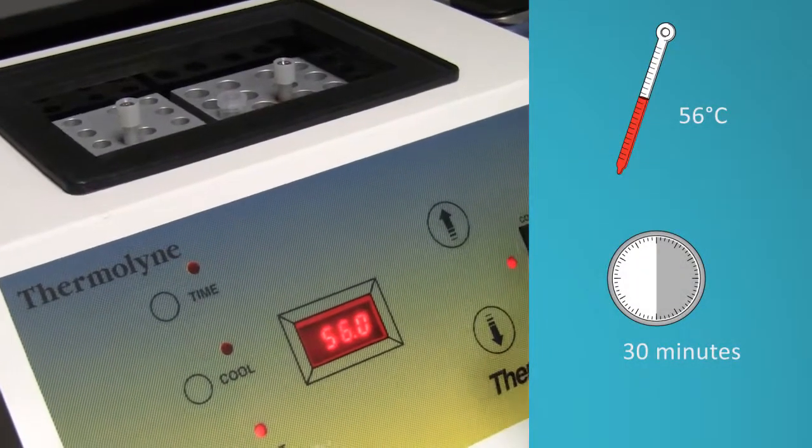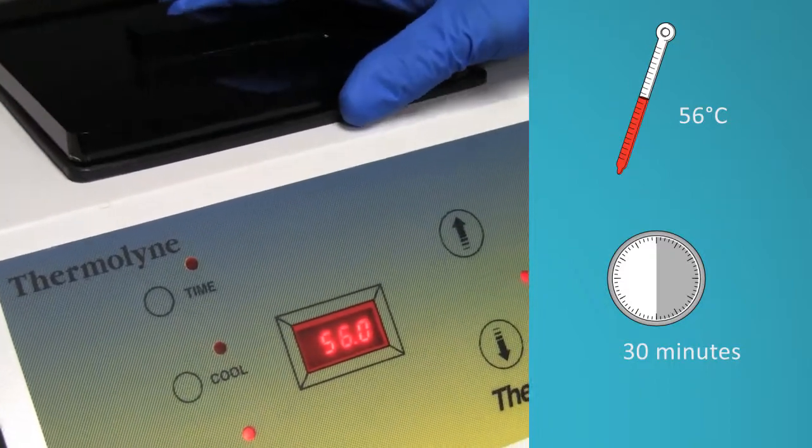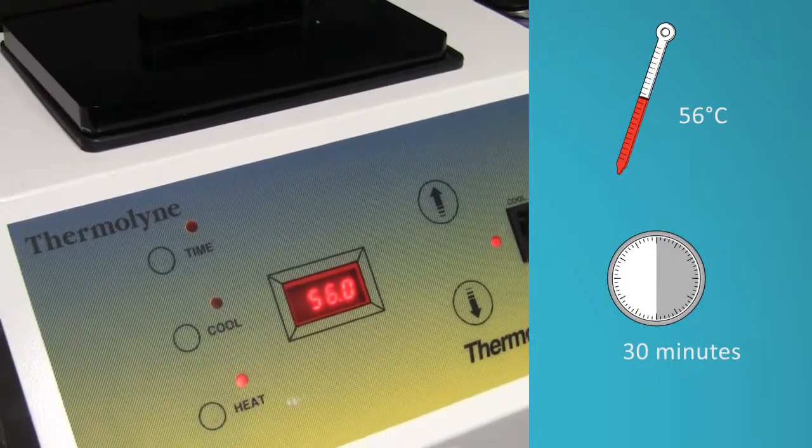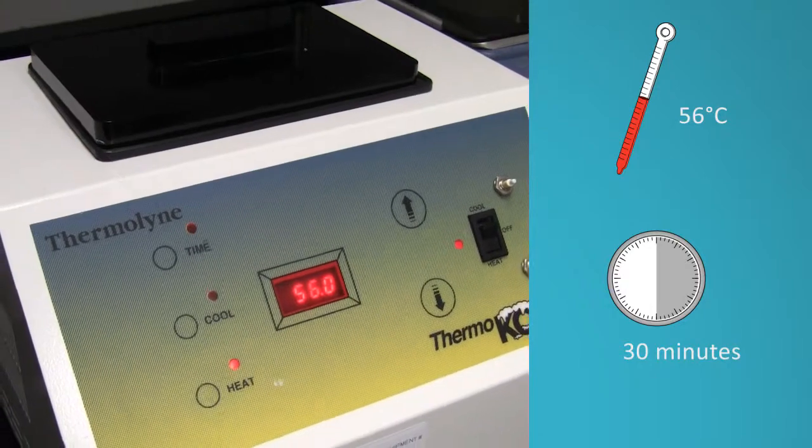Transfer the sample tubes to a 56 degree heat block and incubate for 30 minutes to allow proteinase K to digest the protein.